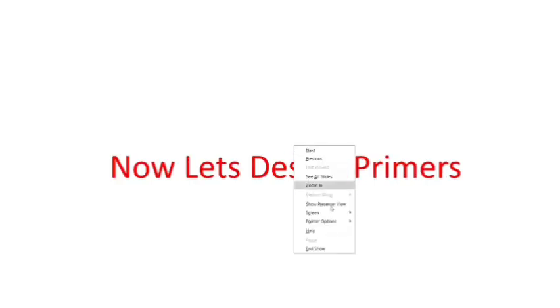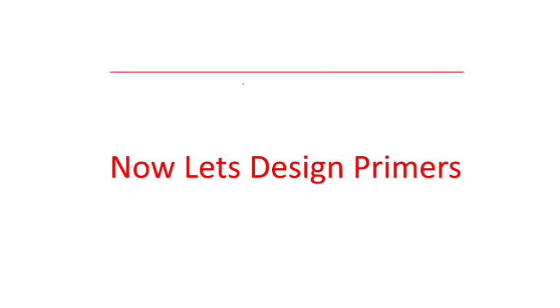I will tell that for designing we have a DNA sequence, and in which this is the gene. So we need to clone the gene. If you are not cloning the gene, for 16S etc., if you want to see some regions of that 16S RNA, we can design the primer somewhere inside the gene, so that we only need a part of the gene, so that we can identify the particular genome or particular gene.